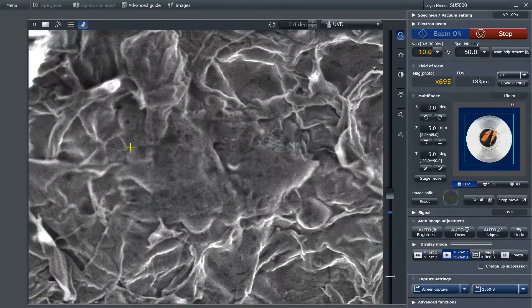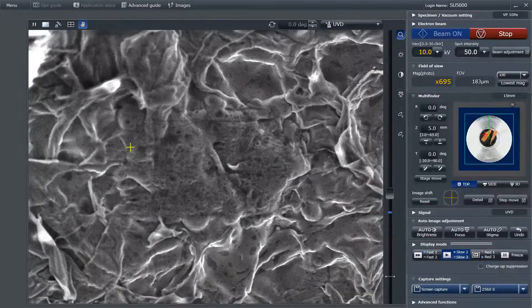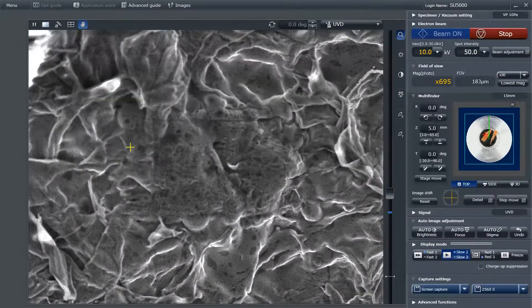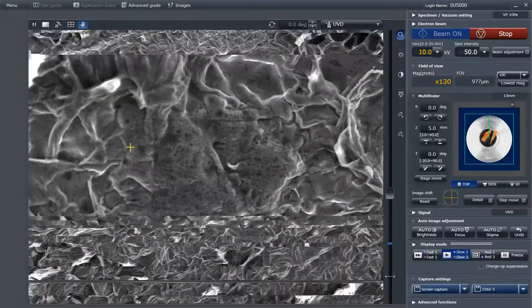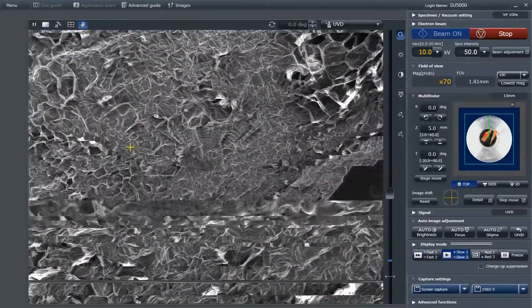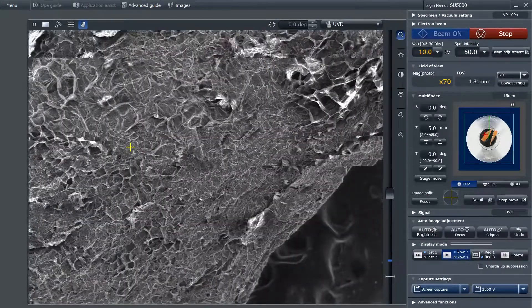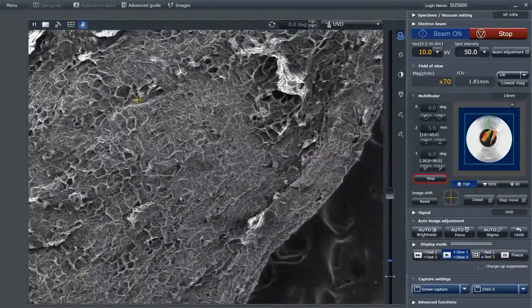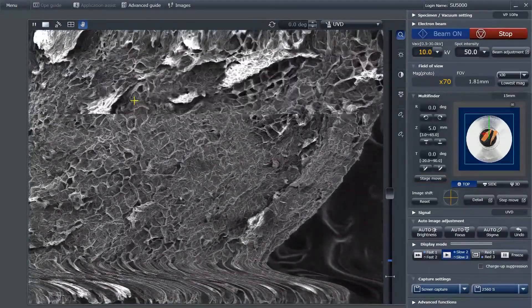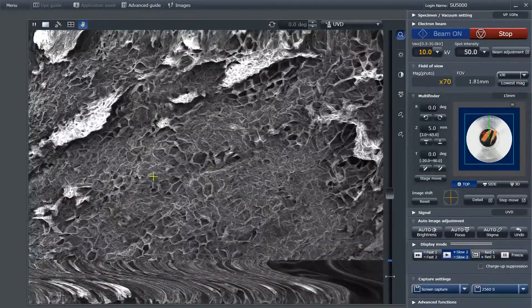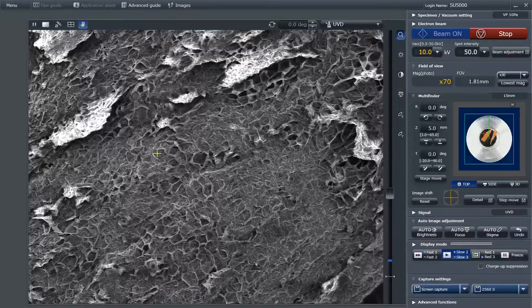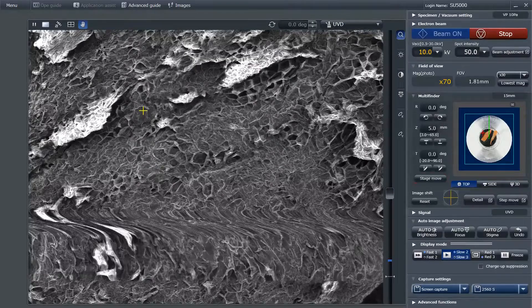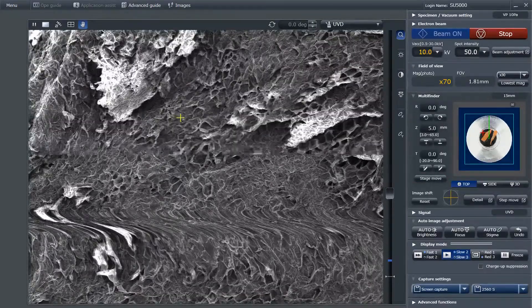Because it has all of those black dots, and the area outside does not. Now I'm relocating to look at something else.